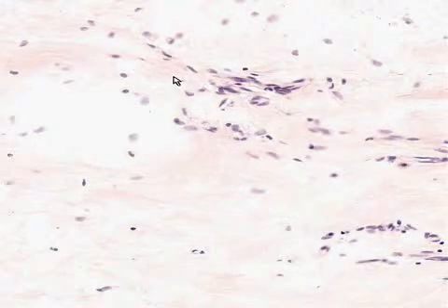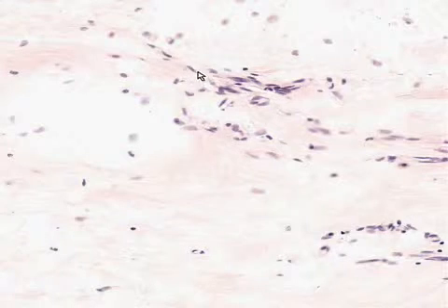That's most likely a plasma cell. That's most likely a lymphocyte. Otherwise, once again, every spindly cell or fusiform cell within connective tissue is a fibroblast until proven otherwise.